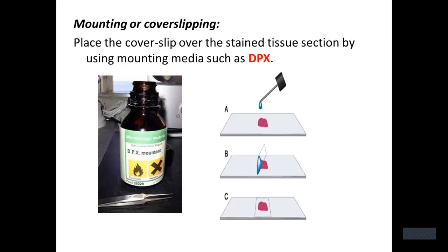We have a simple video to explain the main steps of the histological technique, or paraffin technique.